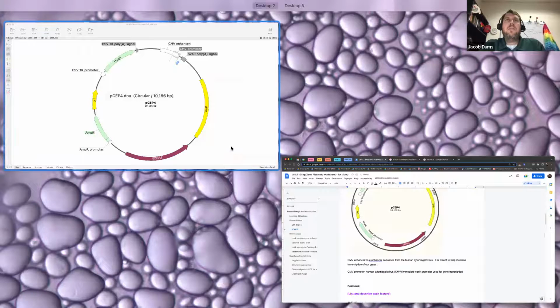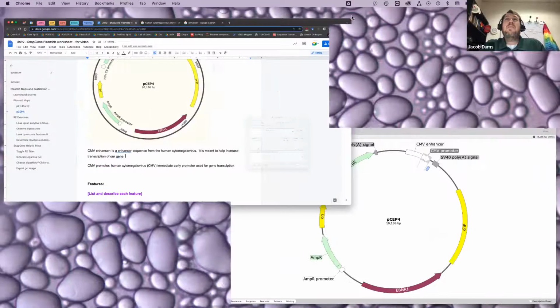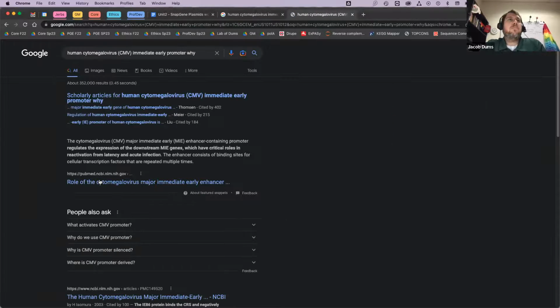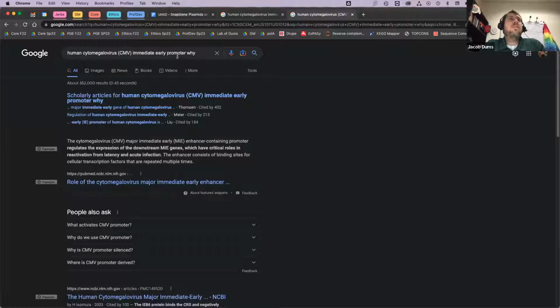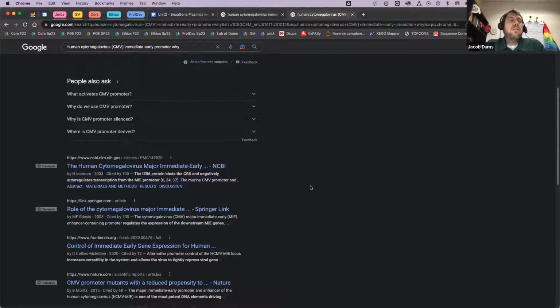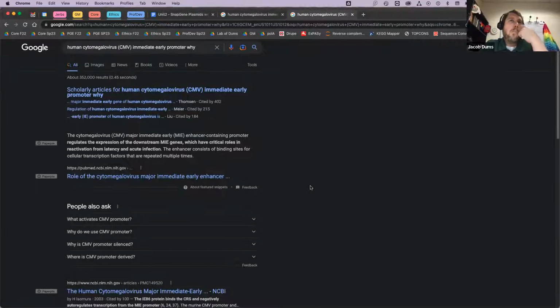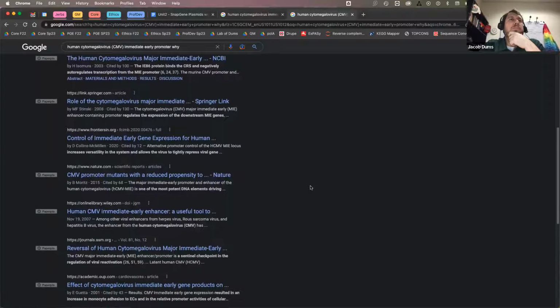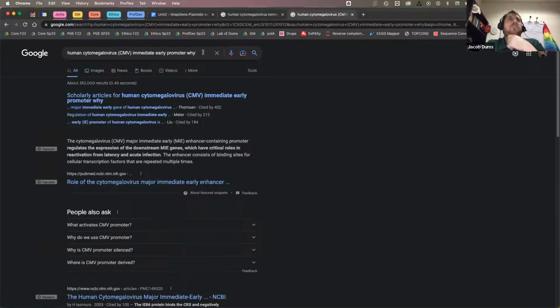Now, part of me probably wonders why this promoter. So again, I can go over to Google and just put in why, and see what comes up. Let's see here. Maybe I throw in the word cloning.